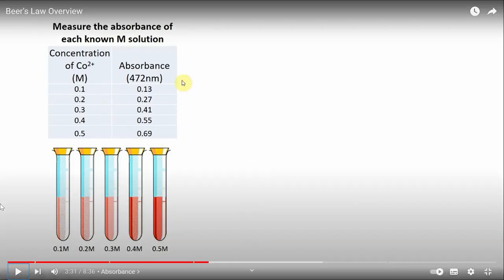Unlike when we were doing the absorbance spectrum, which had only one concentration and we changed the wavelength every time, this time, what are we doing with wavelength? It's constant. Every time we're keeping the wavelength constant. What are we changing this time? The concentration.